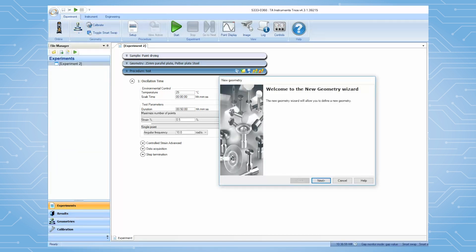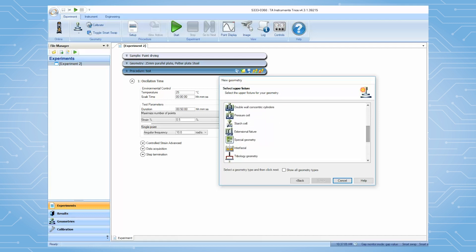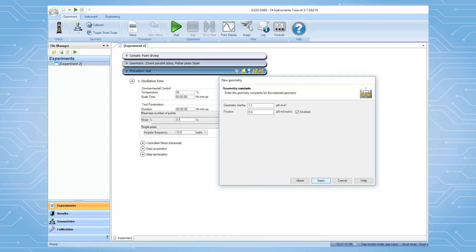Under the geometry list, choose Interfacial Surface Diffusion. Leave all of the parameters as the default values. Then follow the instructions to finish creating this geometry file.